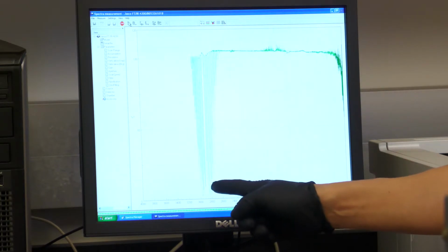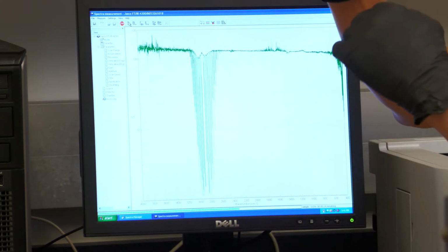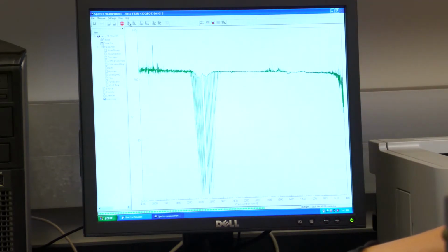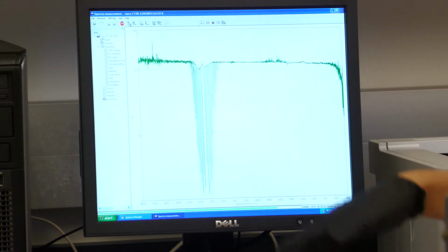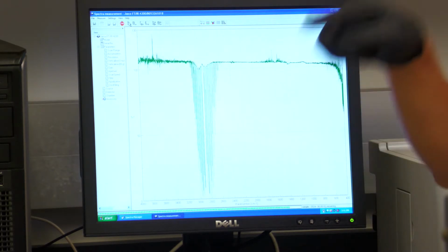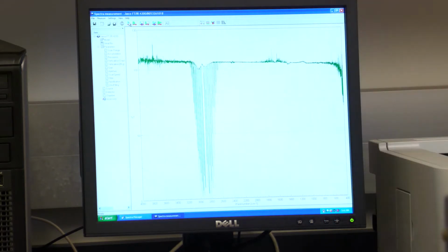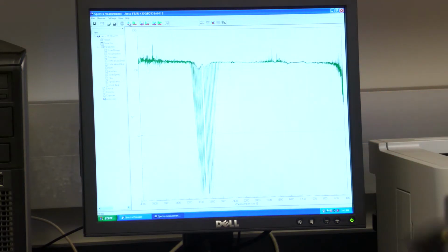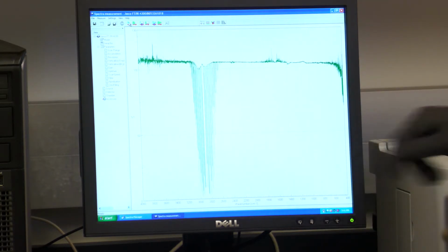This is because going from one vibrational level to the next, the rotational transition delta J equals 0 is forbidden. 1 to 1 is forbidden, 2 to 2 is forbidden. So that is why you're missing one peak, okay? It's very easy. You just finished this one. Now this is the spectrum you measured. Next is how we process this spectrum.